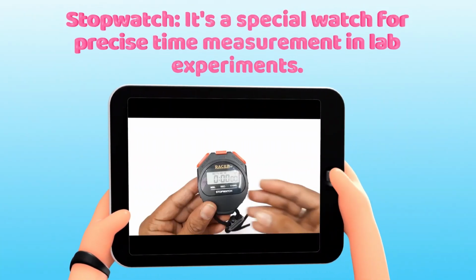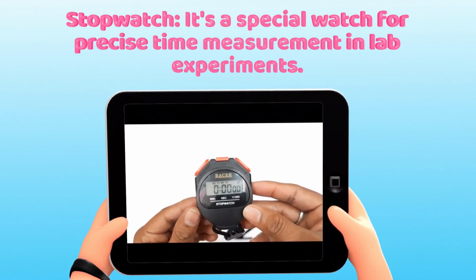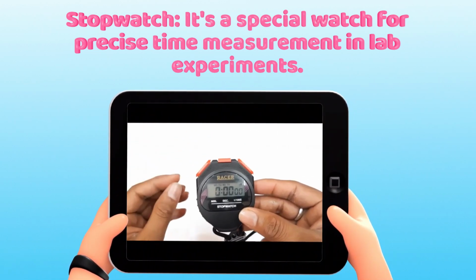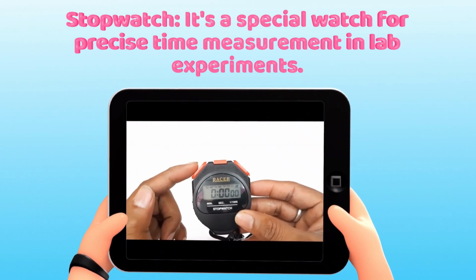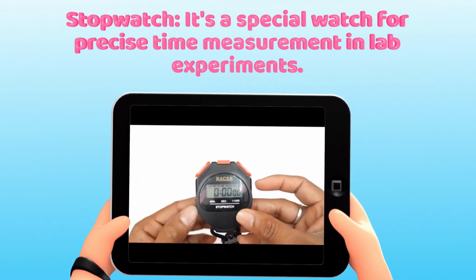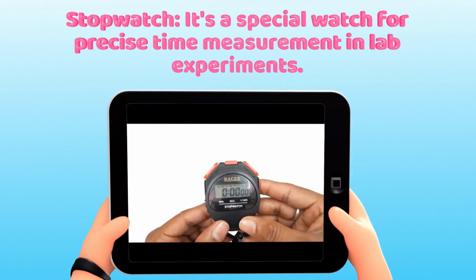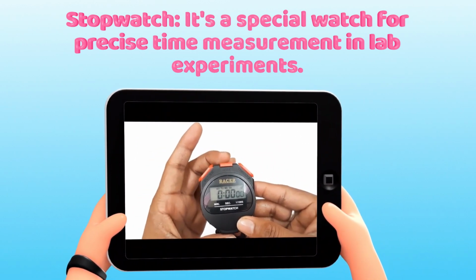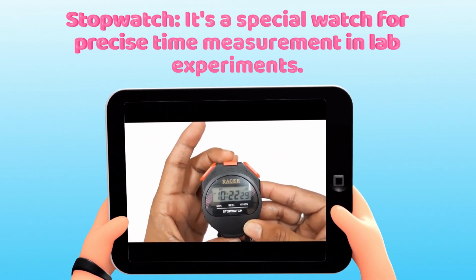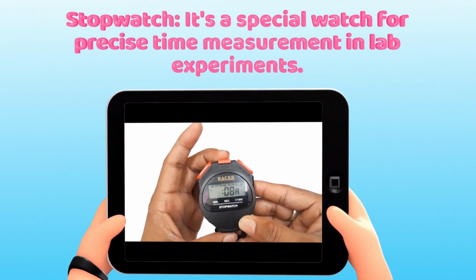Another apparatus is the stopwatch. This is a special watch which is used for precise time measurement when doing experiments in the laboratory. It measures the time taken, for example, for one substance to change from one state to another. It can be used for time estimations basically. As you can see from the screen, that is how it appears, and you can use it simply.